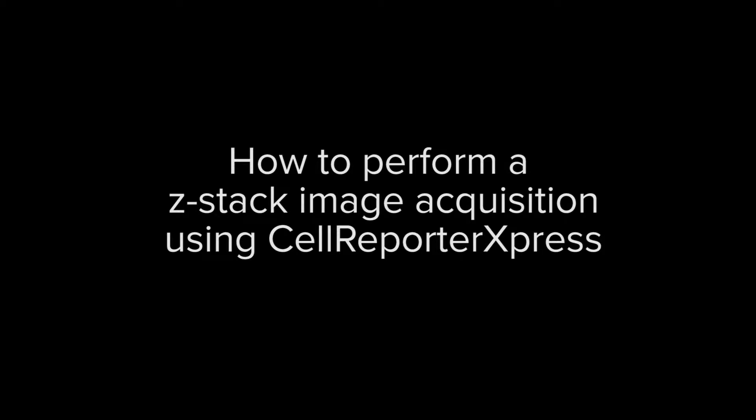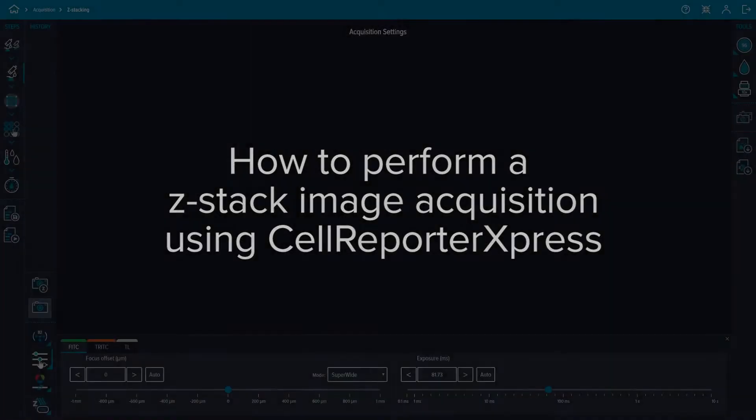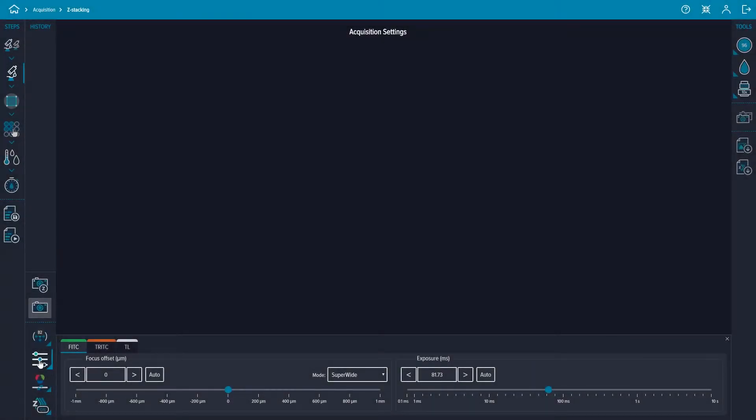In this how-to video we will cover how to set up an image acquisition using the z-stacking feature in CellReporter Express.